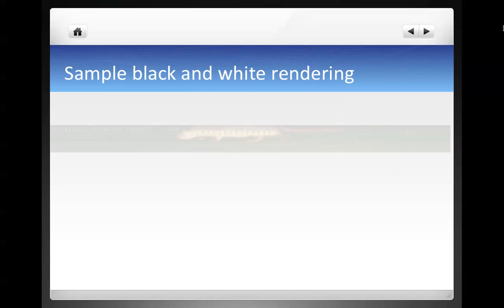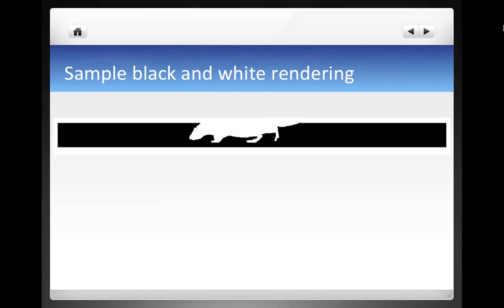This is a sample image of a single frame that MATLAB creates. I have used color segmentation to find green pixels and assign them to black for each frame of the video. It is now possible to use the find function to locate the lowest part of the rodent's body at the floor, shown with the red line.